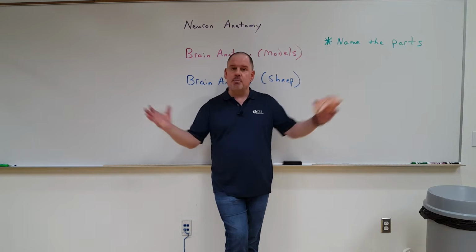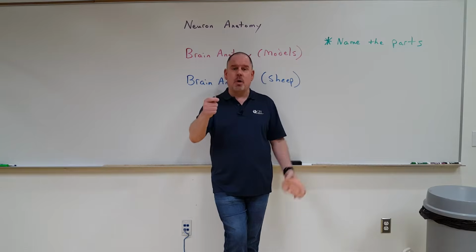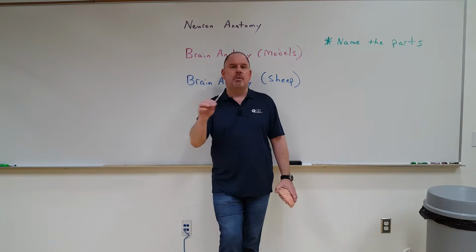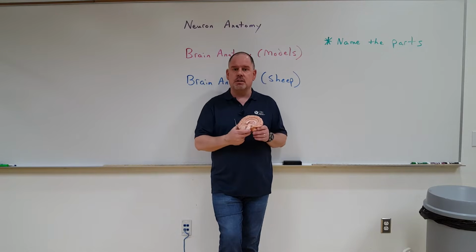Oftentimes during this lab, when students are here in person, it's mostly me or your lab instructor walking around with a probe just pointing at things. You know, where is this? There it is. Where is this? There it is. And many of these things are very close together, so it's hard to tell.